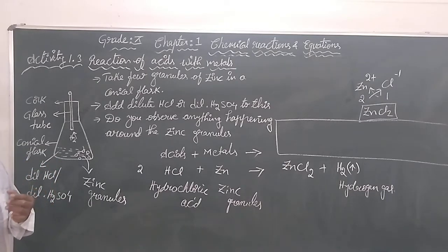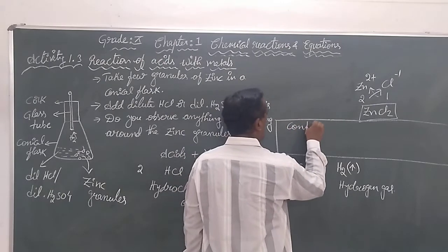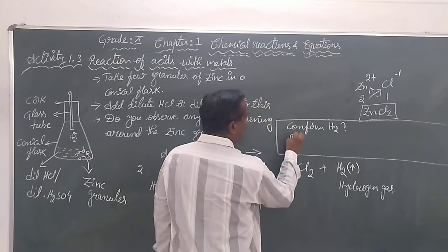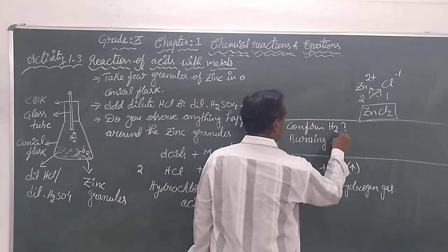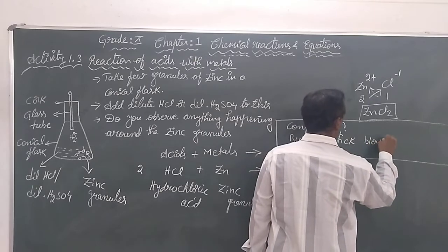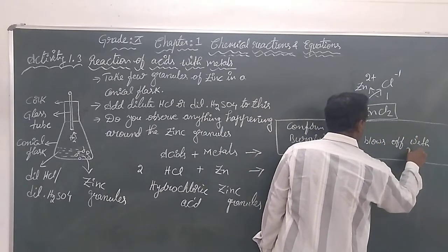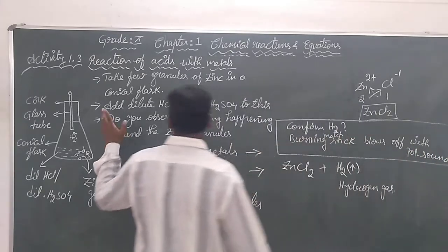So, a very important question: how do you confirm hydrogen gas? When a burning matchstick is brought near the mouth of the test tube, the burning matchstick blows off with a pop sound.